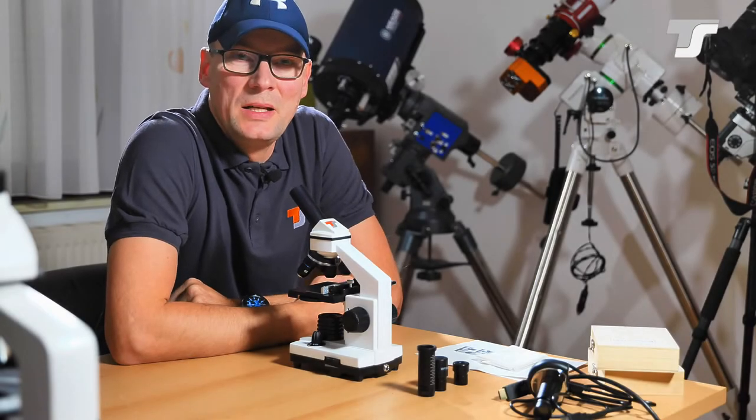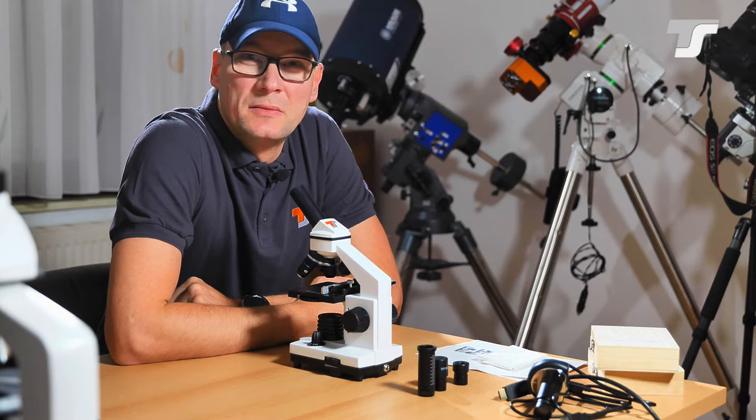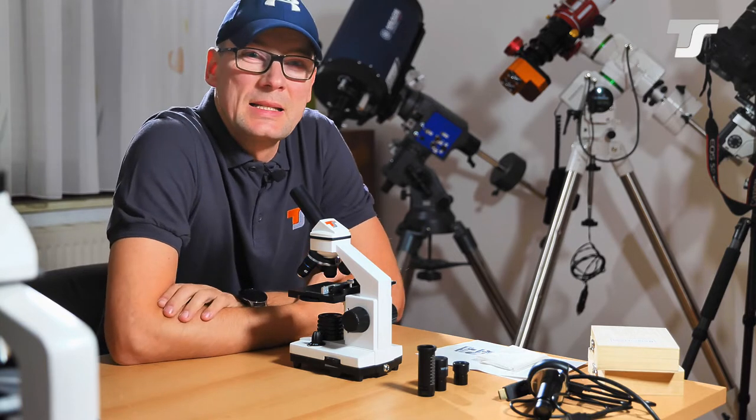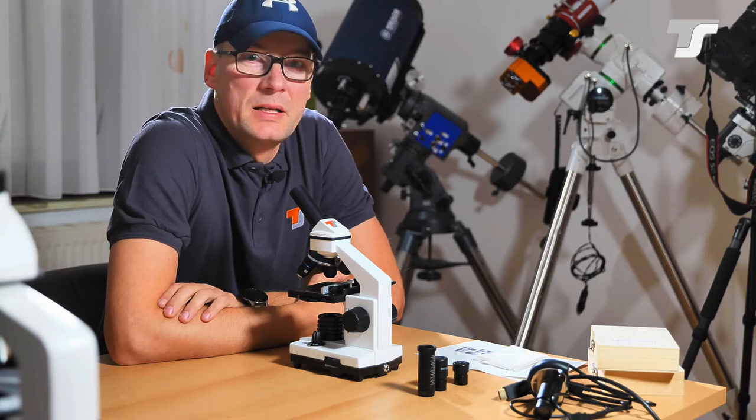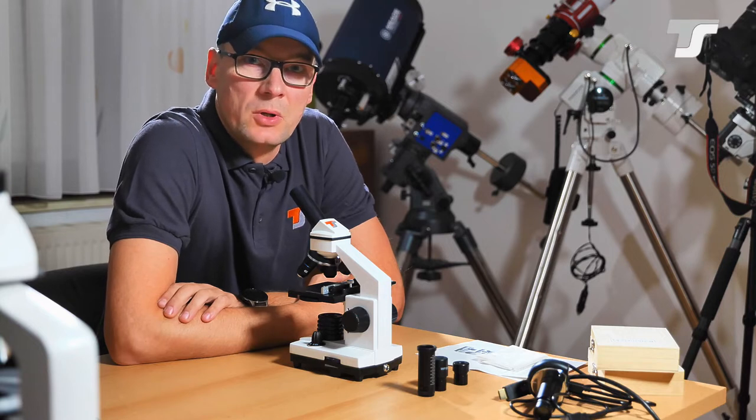Hello and welcome to another video. Today it's not about the macrocosmos that you know from astronomy and telescopes. This time it's about the microcosmos and I want to invite you to join me on a journey to explore the microcosmos.